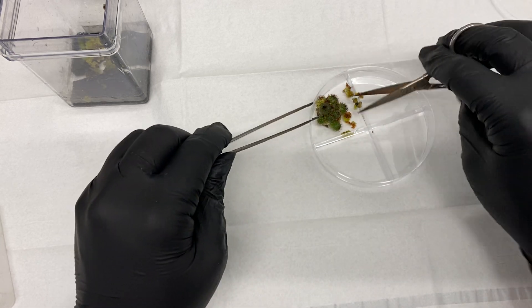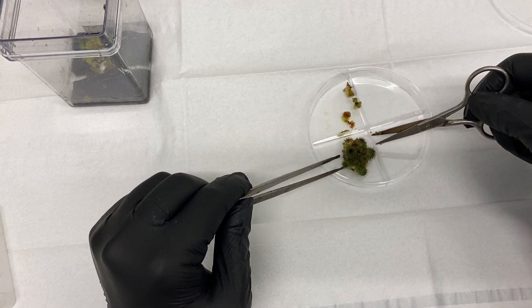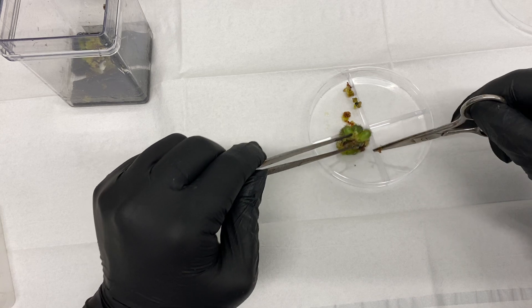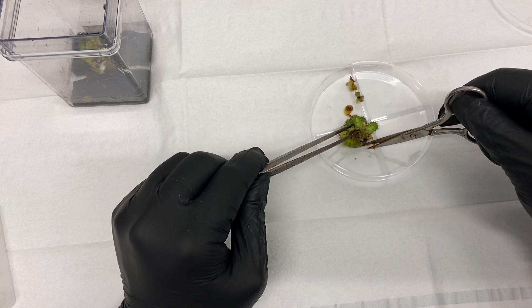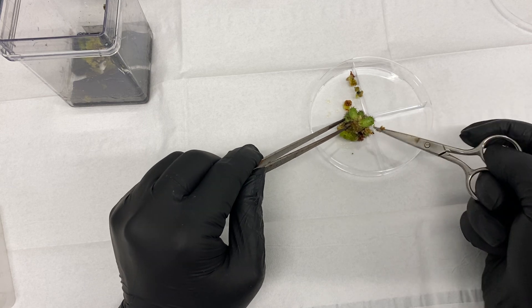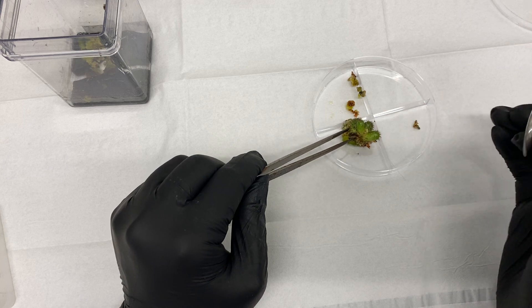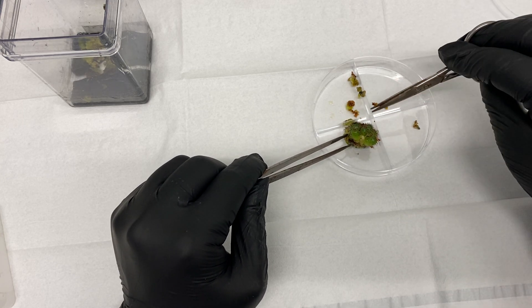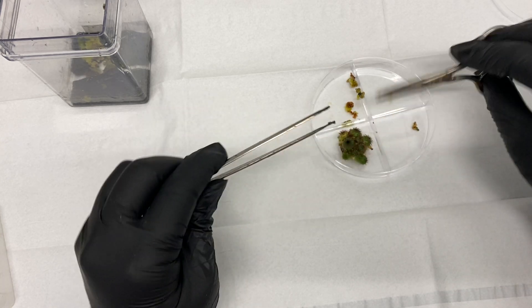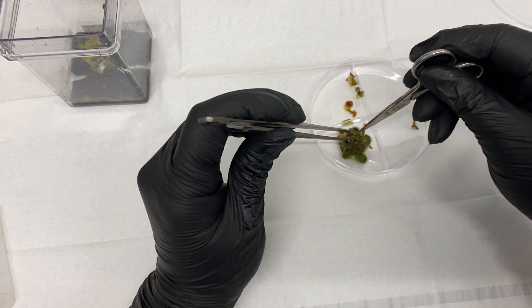As far as the debate over what embryogenic callus looks like — in my experience doing many different species, not just cactus — I don't believe there's a reliable way to tell. A lot of people say it's the green one or something like that, but I've seen white callus also be embryogenic. If you think about the principles of plant science, every single cell is totipotent, which means every cell can become a meristematic cell.